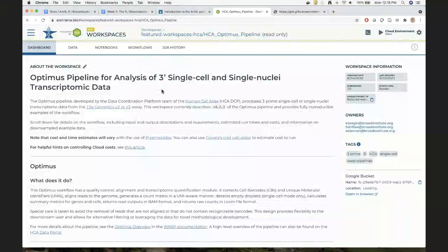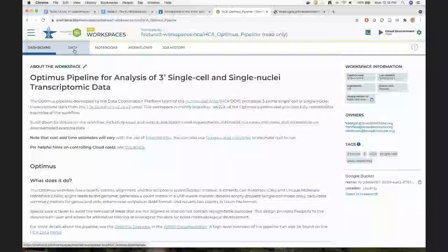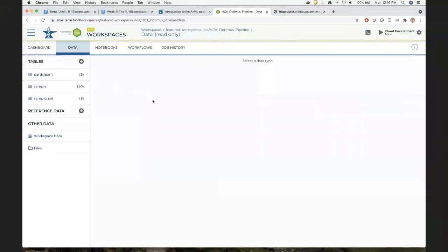It's kind of fun, right? We've got this data and it's going to be processed in a standard way. We'll see how we do the data analysis here. I'm going to pay no attention to these error messages that keep showing up. We're not actually going to do the analysis, but we're going to orient ourselves. We'll do an actual workflow next week. So here's our workspace, and I'm going to look at this data tab. We didn't actually look at the data tab last week.